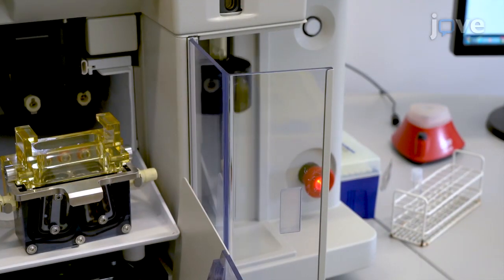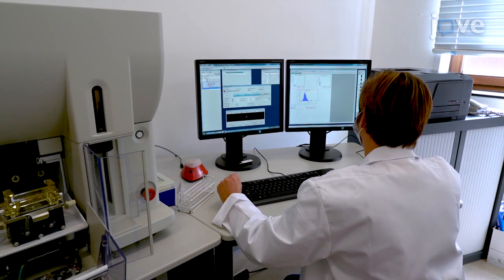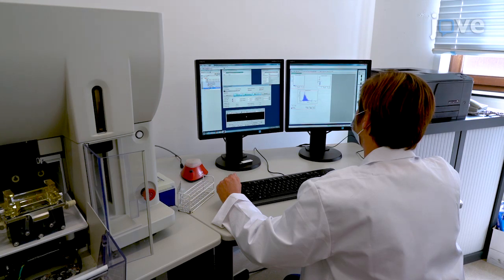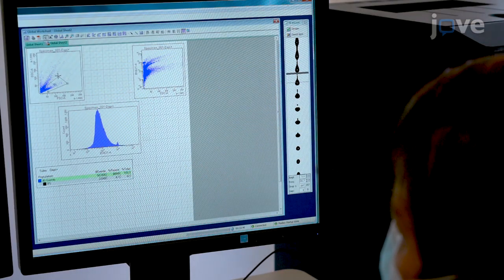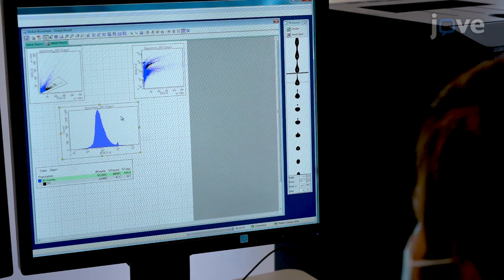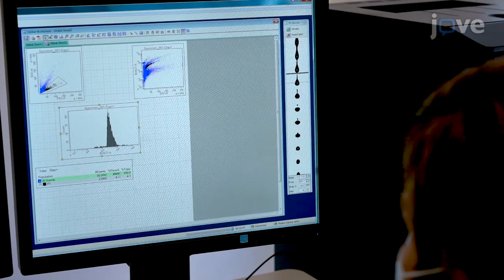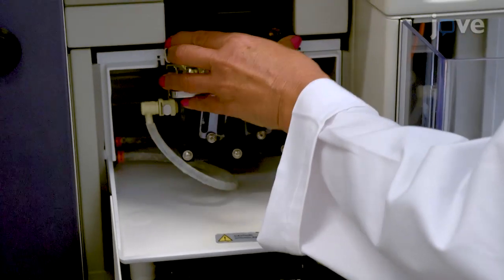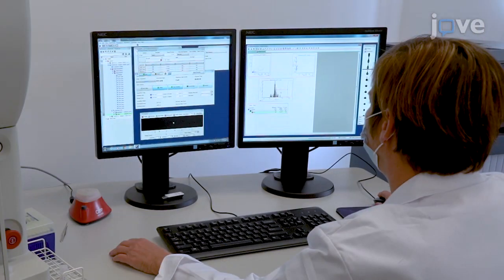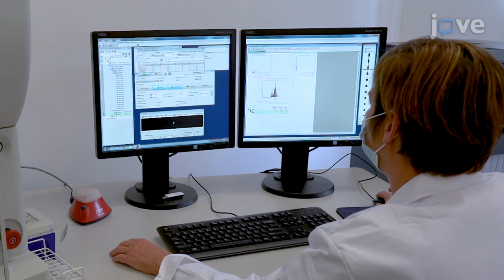Load the unstained control sample into the cell sorter and record 5,000 events. Then load the stained sample and record 5,000 events. Draw FACS gates for identification of single nuclei by comparing the HOECHST fluorescent signal between the control and stained samples. Then sort HOECHST-positive nuclei from the stained tube into a new 1.5 milliliter tube containing 50 microliters of PBS with 5% BSA.